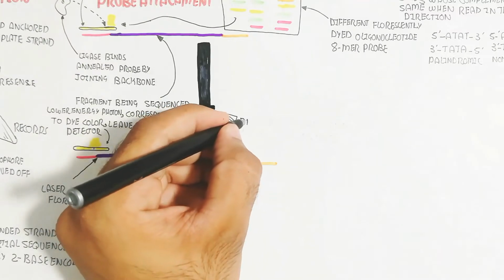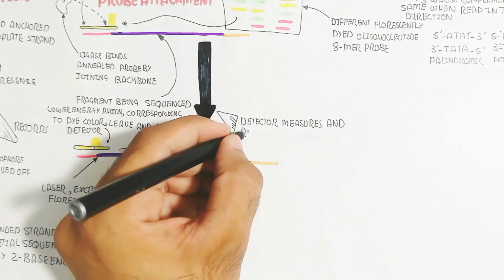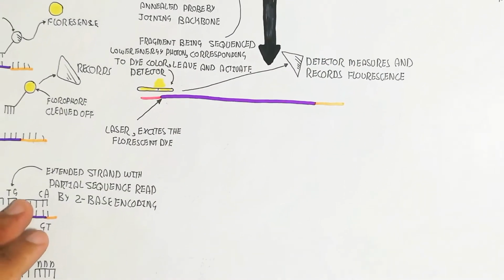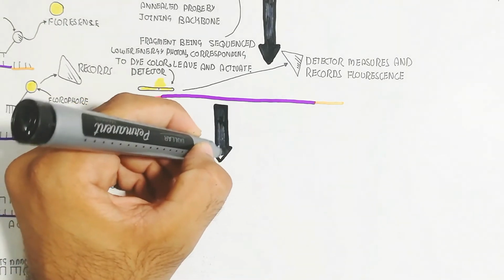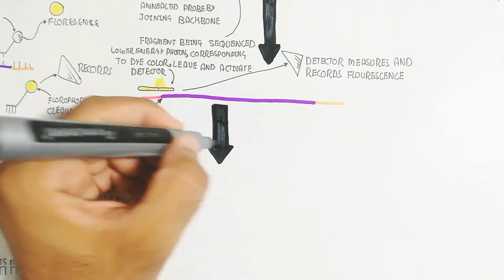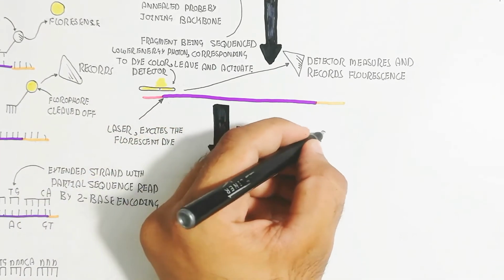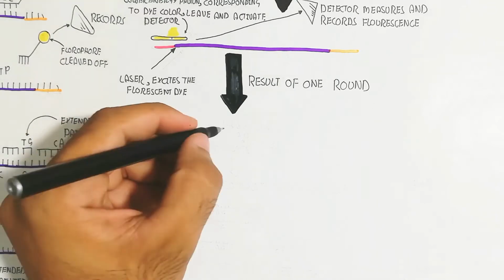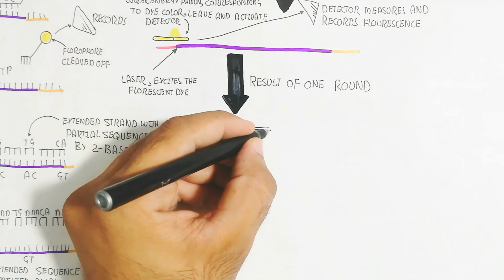Anyhow, the result of one round is not enough. So we can run again and again, but remember the complete cycle. Five cycles can be possible, and five cycles are enough, and incomplete data will become complete data after the five cycles.